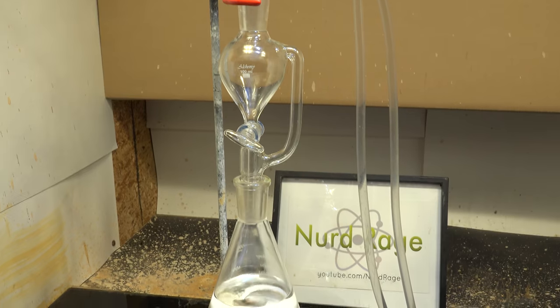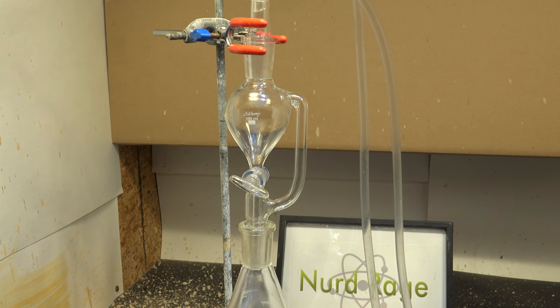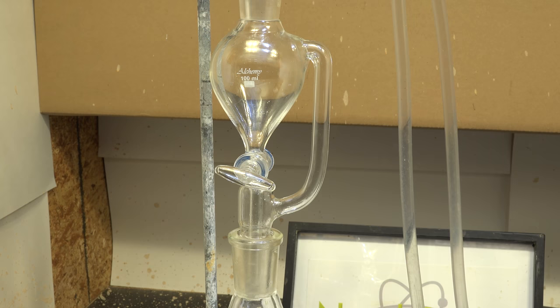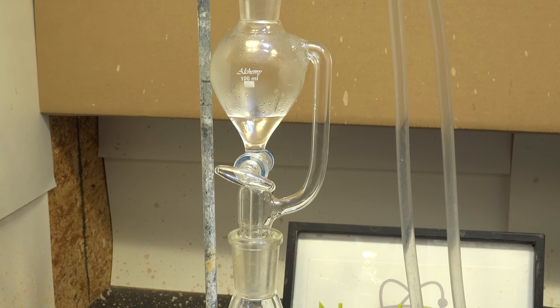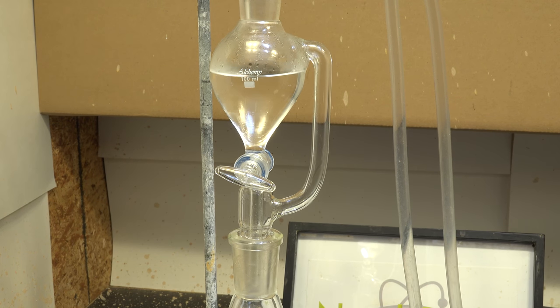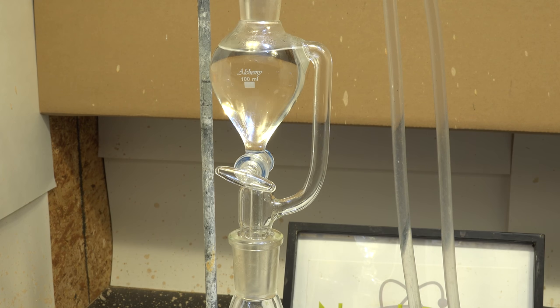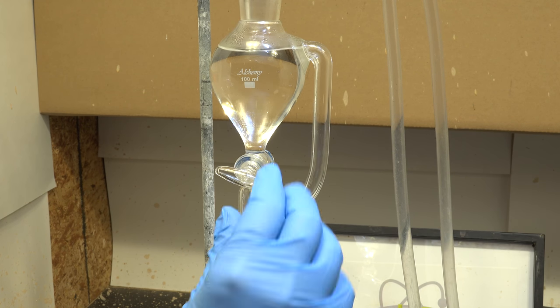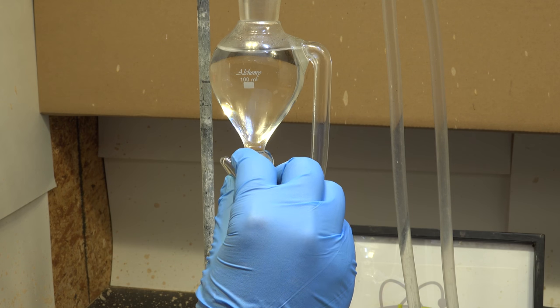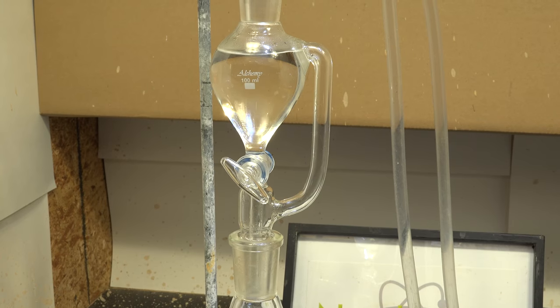You place your teabag chemicals into the separatory funnel, install the rest of the parts along with the solvents, and begin boiling with the valve closed. The vapors will travel up the pressure equalizing tube and into the reflux condenser. They'll distill and accumulate inside the funnel. Now wait until it overflows. Without a siphon tube, it'll never completely empty out. Now very carefully open the valve just a crack until it starts to drip. But don't open it far enough that it empties.